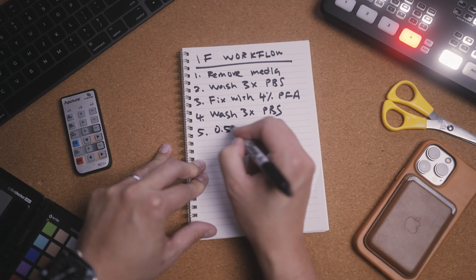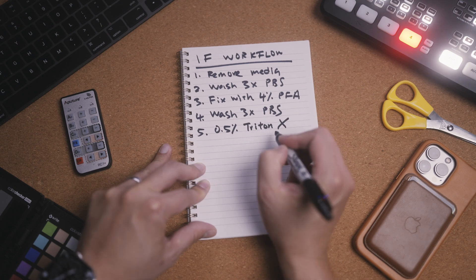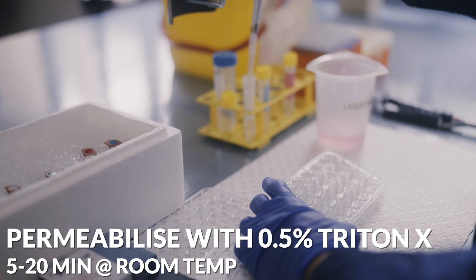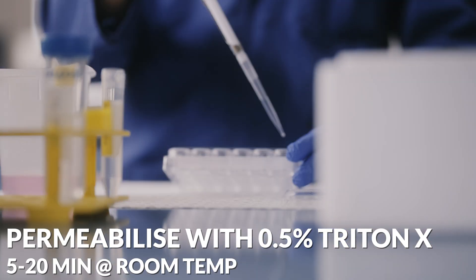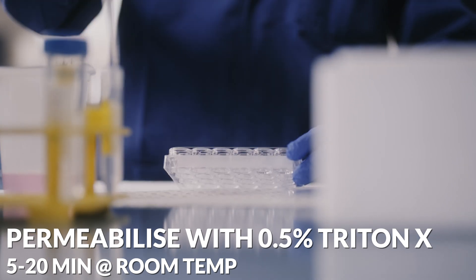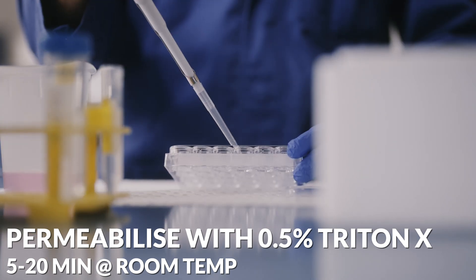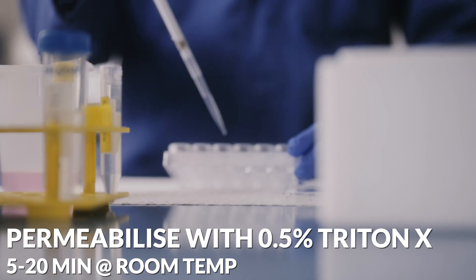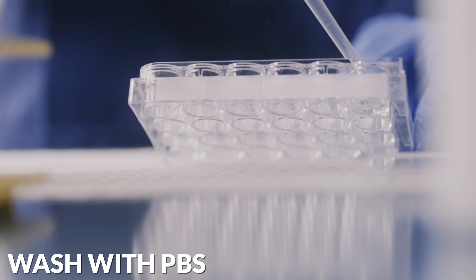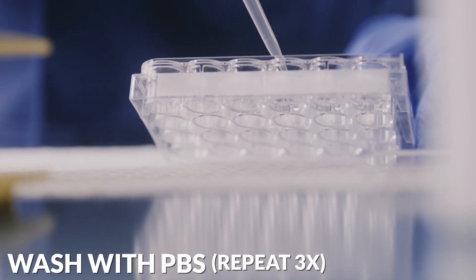The next step is to permeabilize the cell membrane using detergents — in this case 0.5% Triton X-100. This step can be considered optional if what you're labelling is on the surface of the cell membrane, but the majority of immunolabelling targets proteins inside the cell. This permeabilization step will allow the antibodies you add onto the coverslips to penetrate the cell and bind to the right molecules with high affinity. This can take anywhere from 5 to 20 minutes at room temperature before washing the detergent off with PBS three times.